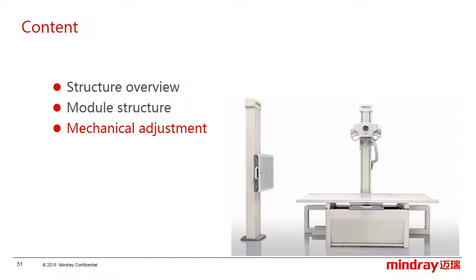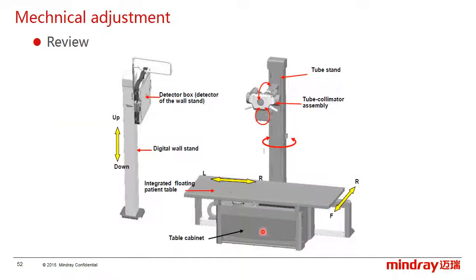The last part is about the mechanical adjustment. Let's review the movement of the whole system. As we know, DigiEye280 is a full manual movement system.